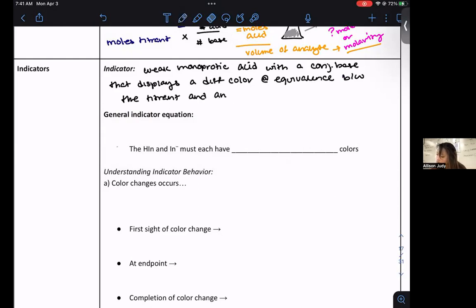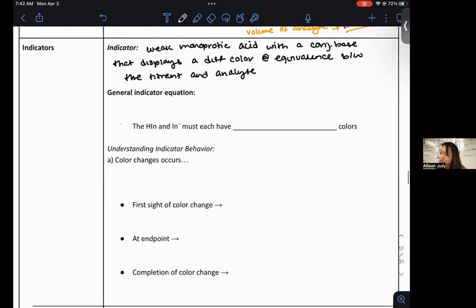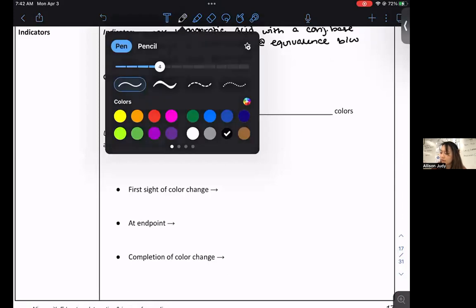All right. So what we're seeing here is that we're actually having an acid-base reaction with the indicator, but we're pairing it or aligning it with the acid-base reaction, and particularly the equivalence point of the acid-base reaction between the actual titrant and analyte solution that we're examining. And we're using it to mark, okay, where and when we've reached equivalence for the actual solutions that we are interested in.